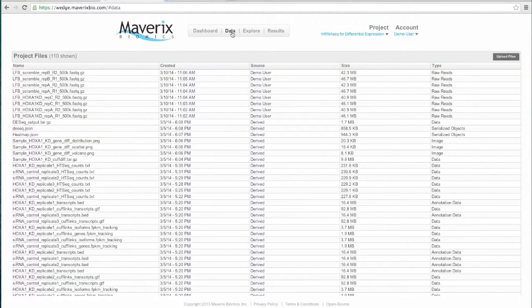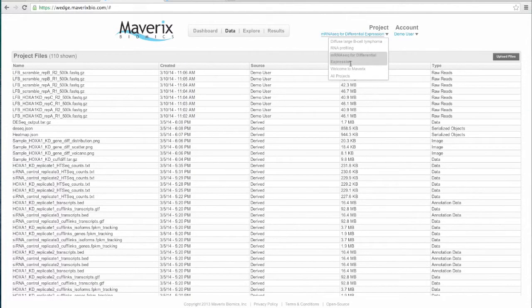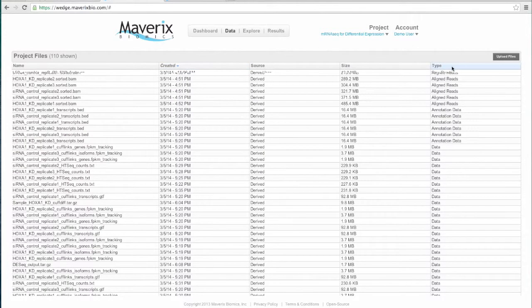So moving to the Data tab, as I said, what we're looking at here is all of the files in our project file library that are associated with this particular project that I've selected. If I were to select a different project, that content would change. This is a sortable table, so you can sort this by create date, by data type.